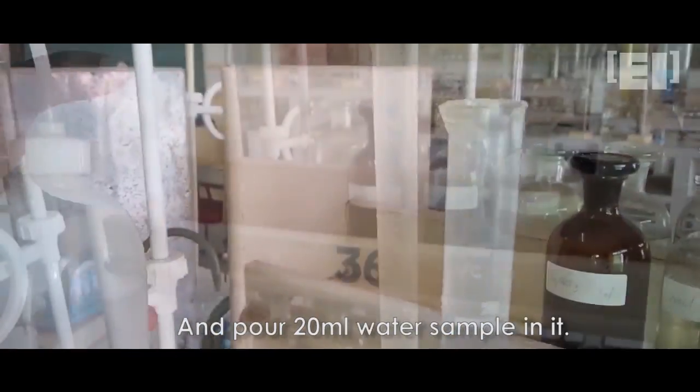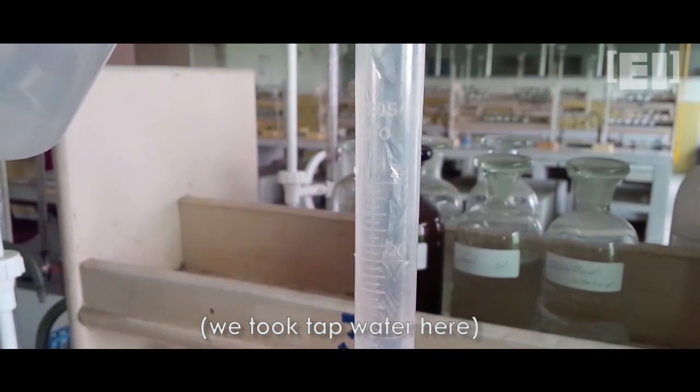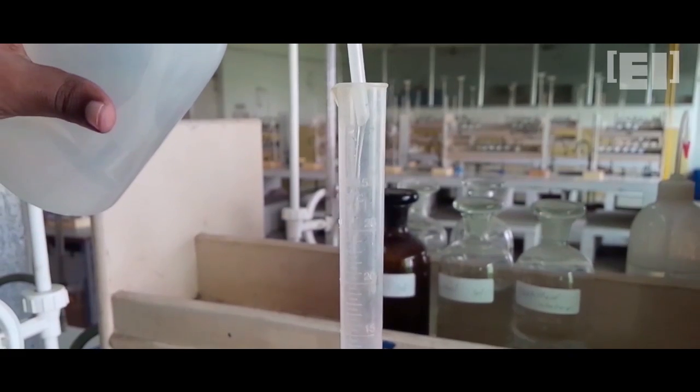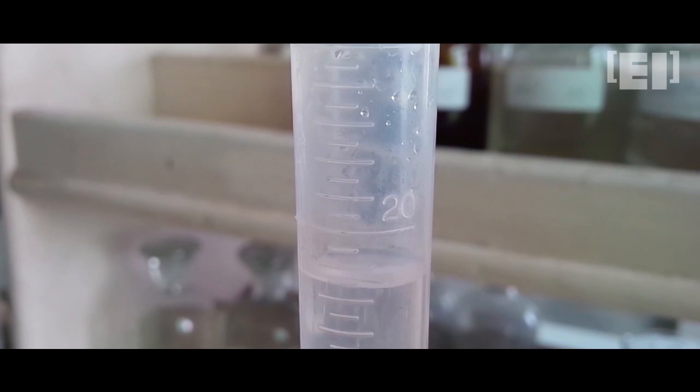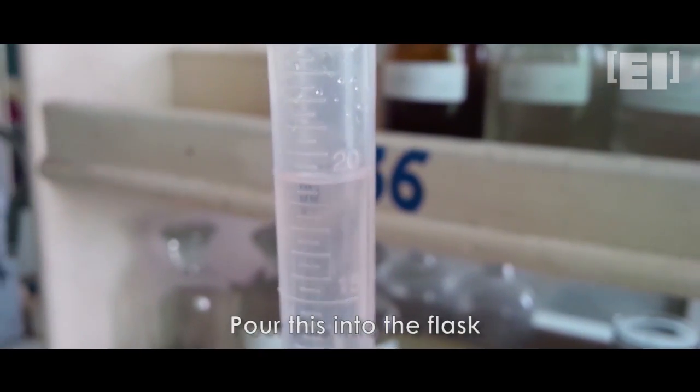Pour 20 ml of given water sample in the measuring cylinder. That's done! Pour this into the flask carefully.